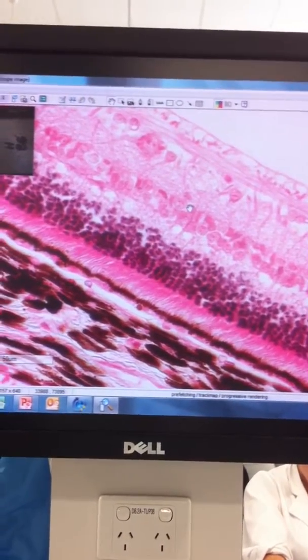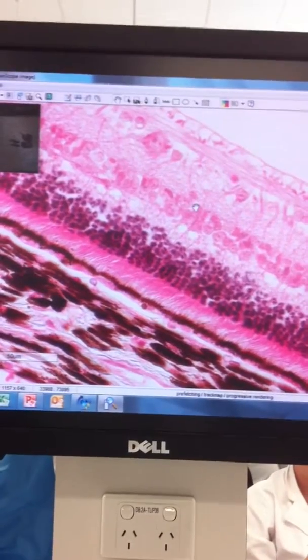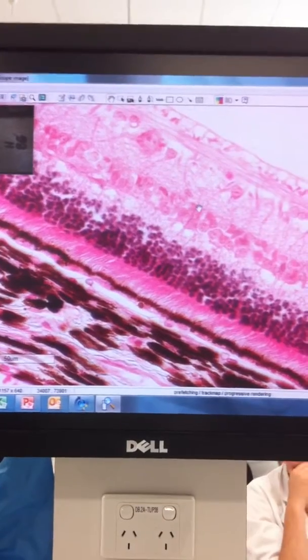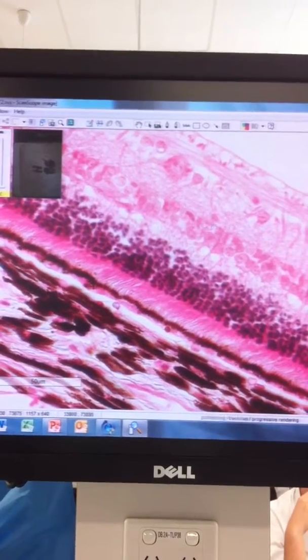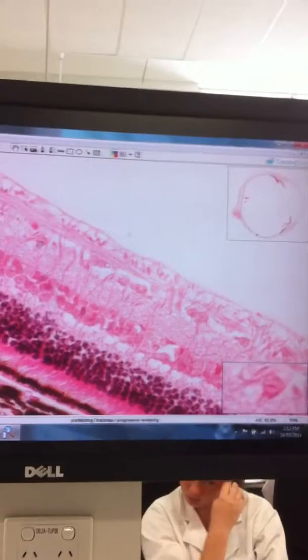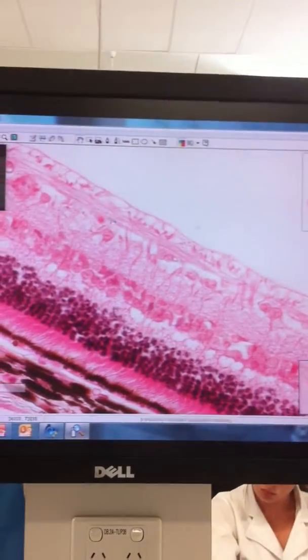This is the bipolar cells, the amacrine cells, and the horizontal cells. All do fine-tuning. You're not expected to be able to tell the difference between them. They're all sitting there. Then we've got the inner plexiform layer, and then we can see these big cells here. There's one there, there's several of them. And their processes run up here to form the optic nerve.